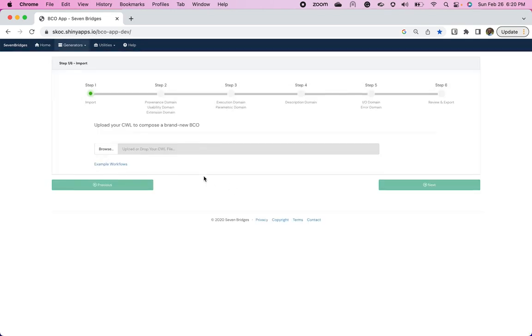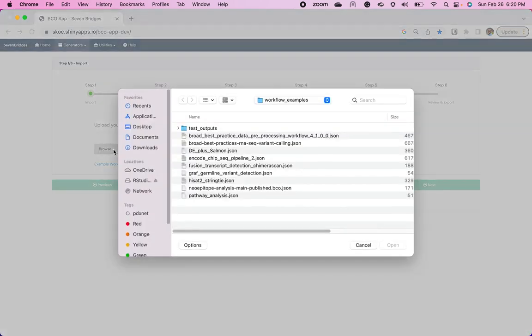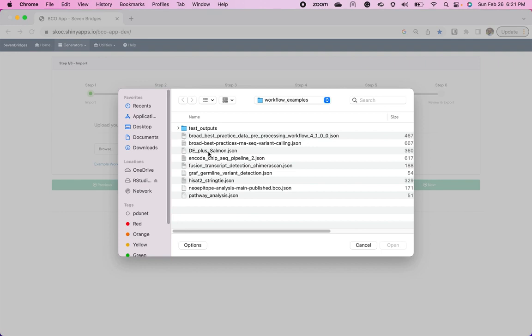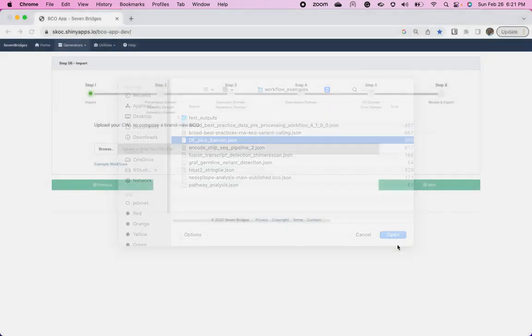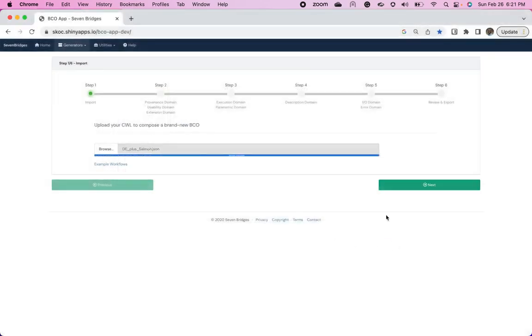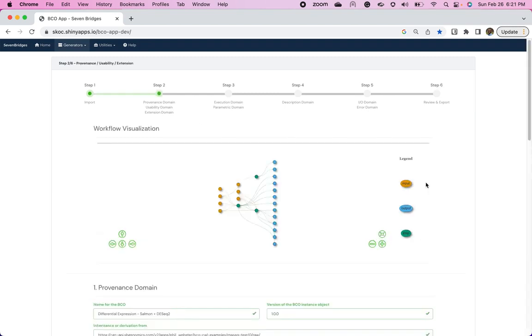And what this allows you to do is it allows you to upload CWLs from your local and generate a BCO. So for example, I have a folder of workflow examples that I am aware works. And I'm going to use a differential expression using salmon alignment analysis that I made for a Purdue seminar that I did. Who says you can't teach while in industry? So that's uploaded as a JSON file. I'm going to click next.